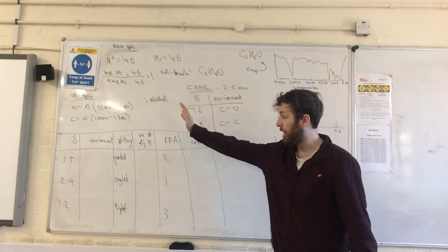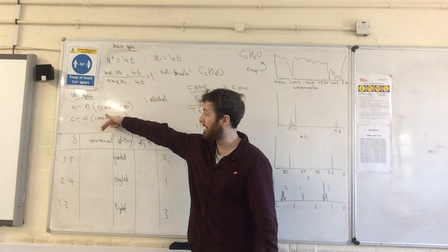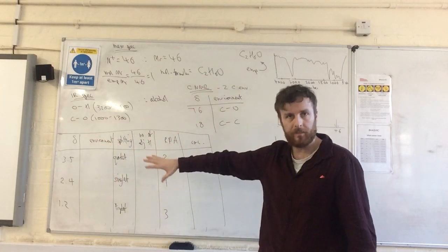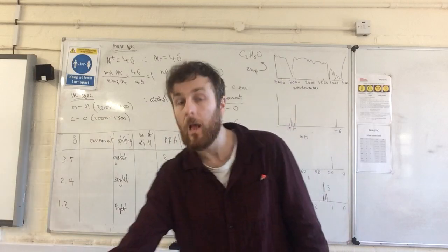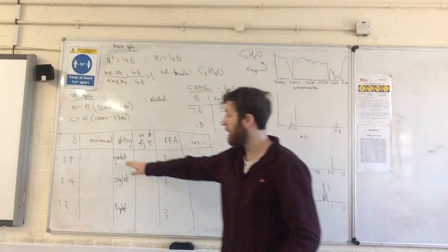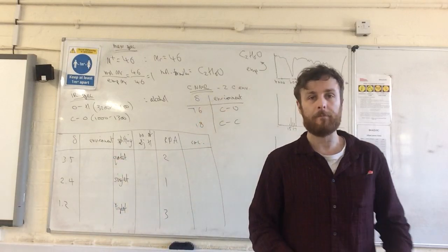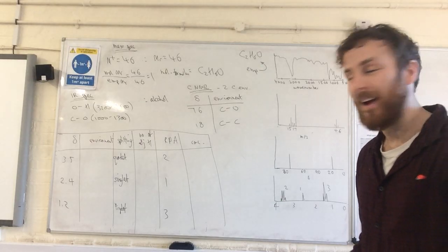So from the graph we can fill out these 3 columns. And then from the chemical shift we can tell the environment. Again, always look back at your previous information, especially the functional group. So stop the tape, try and figure out what 3 environments these 3 things must be. Start when you're ready. Okay, welcome back.